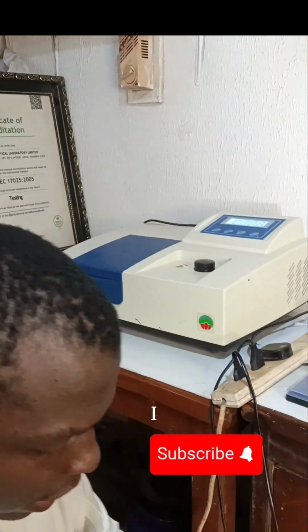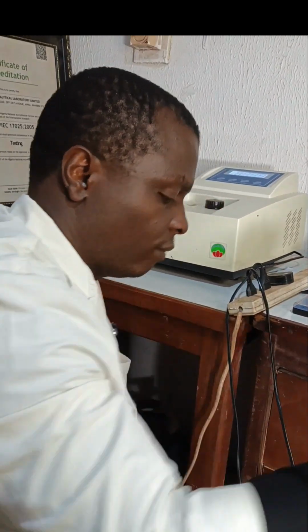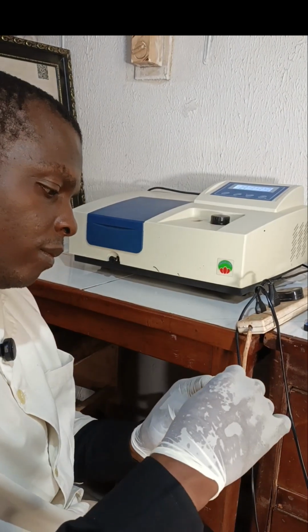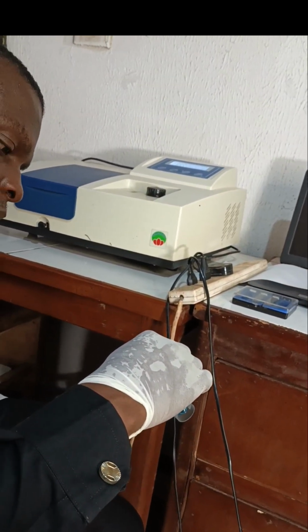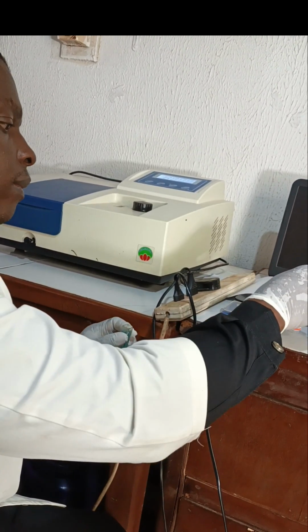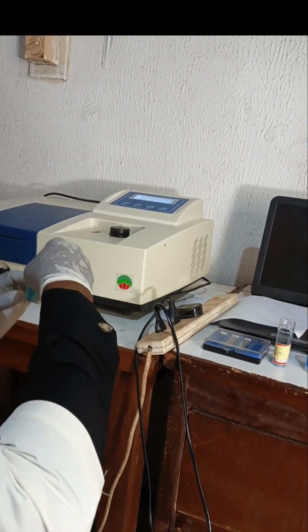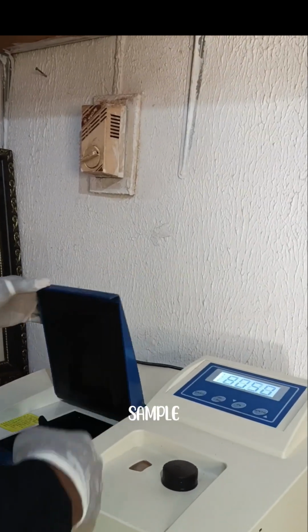So I clean another cuvette and then place the sample.